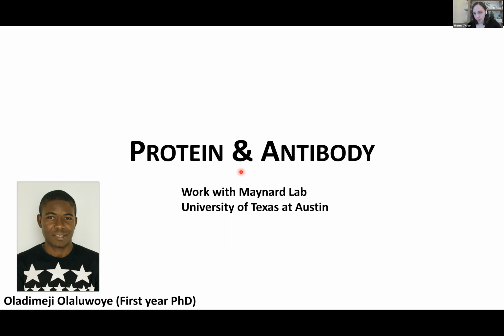But again, many have come before us, and there are many protocols and papers available to guide you through doing this. This is work that we did with the Maynard Lab at UT Austin. I want to point out this was done very quickly by a first-year student in my lab. The reason I want to point that out is because often professors are worried that it's going to take students a long time to learn how to do an HDX experiment. This student had no prior experience with HDX or mass spectrometry, and in the space of about 4 to 5 months was able to produce this really nice data.